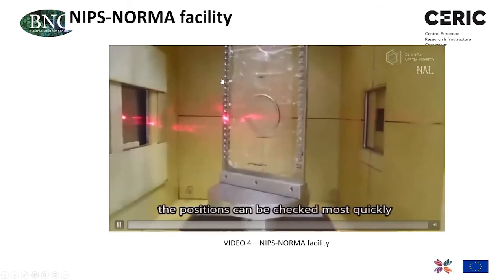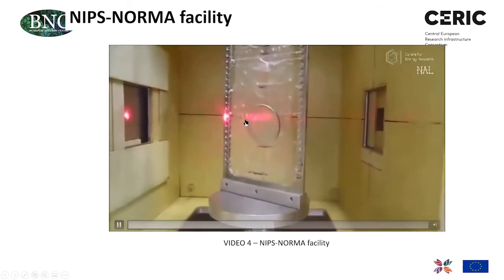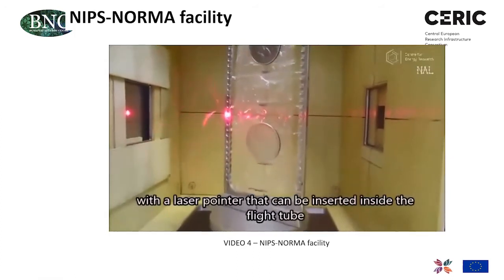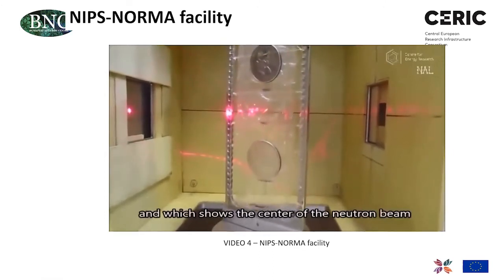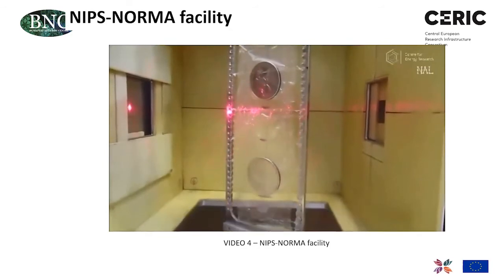And we have also a laser marker that can indicate the adequate position of the sample. So you can align your complicated geometry objects relatively easily to the measurement position.